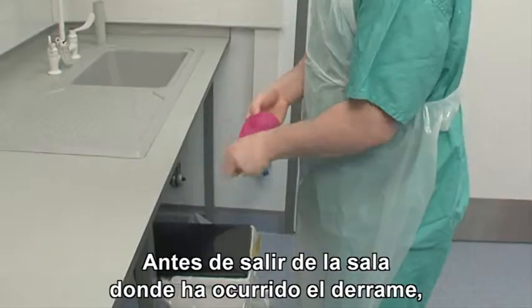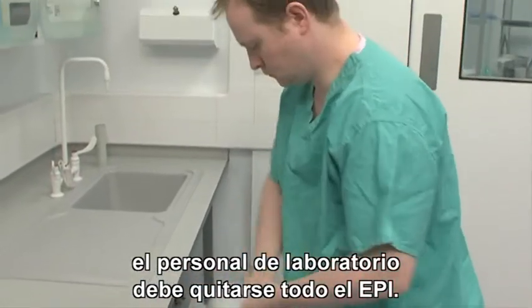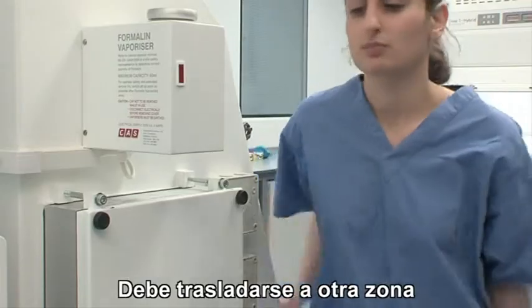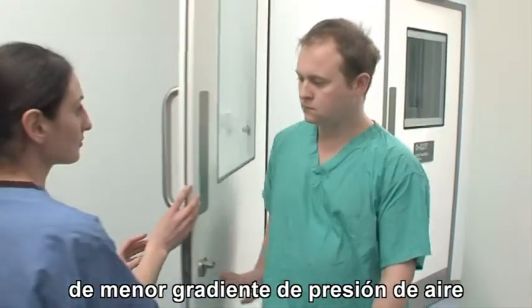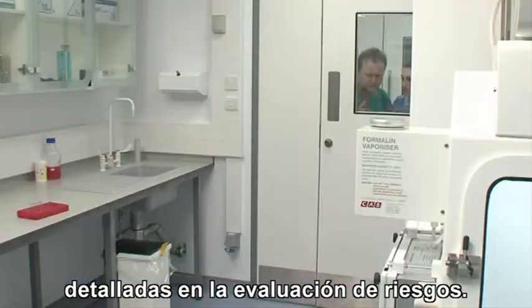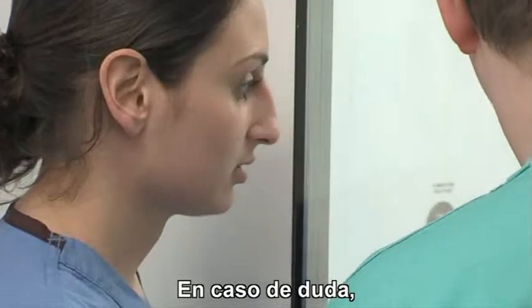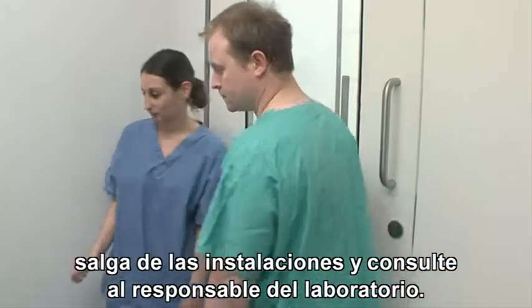Prior to leaving the room where the spill has occurred, lab staff should remove any PPE. Relocate to a new area in the facility that's against the gradient of air pressure and assess what actions need to be taken. These will be listed in the risk assessment. If you are in any doubt, exit the facility and consult the building officer.